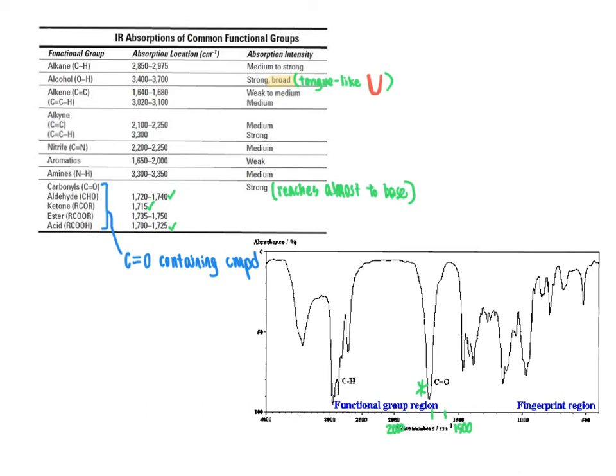We come onward going left in our spectrum. The signals we're seeing right here at around 3000 are your C-H signals. They are not going to be alcohols because it is not a broad tongue-like shape, so don't mistake this for an alcohol. Instead, those are C-H groups of alkanes or could be carbon-carbon double bonds and hydrogens of alkene groups.